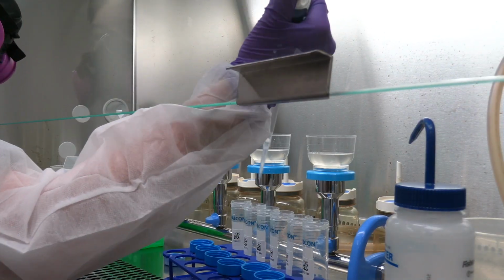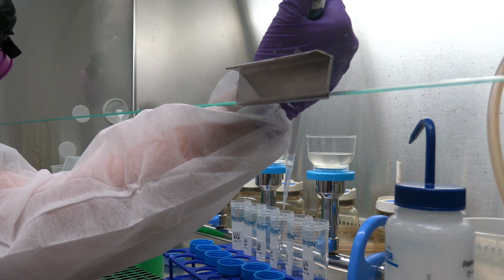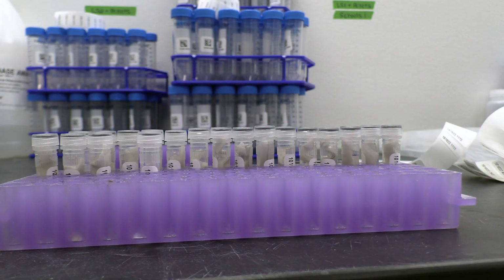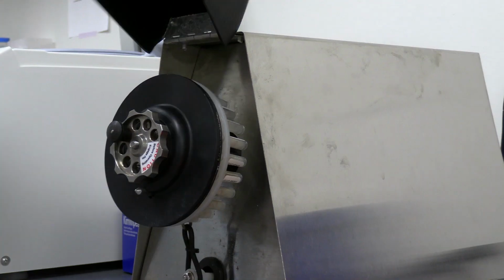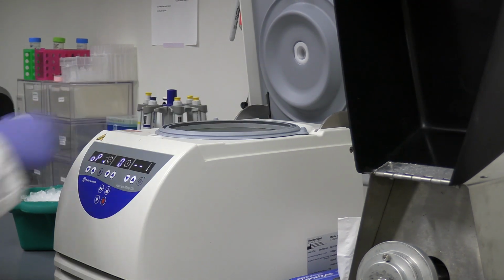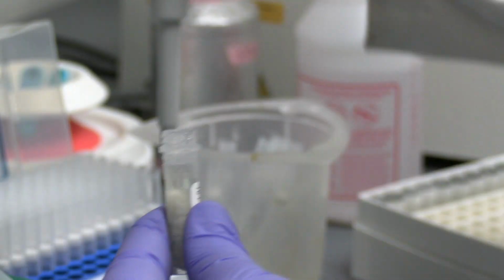While the supernatant is typically used to concentrate SARS-CoV-2, other viruses are known to adsorb more effectively to the solids fraction. With the addition of lysis buffer, solids can be resuspended for further processing. After filtration, electronegative membrane filters are transferred to sample tubes containing glass beads and lysis buffer. Bead beating is a critical step for us to ensure cell lysis and accurately quantify nucleic acid in wastewater. Centrifugation after bead beating is used to separate out the lysed cells and helps to prevent the transfer of glass beads and filter particles during extraction.